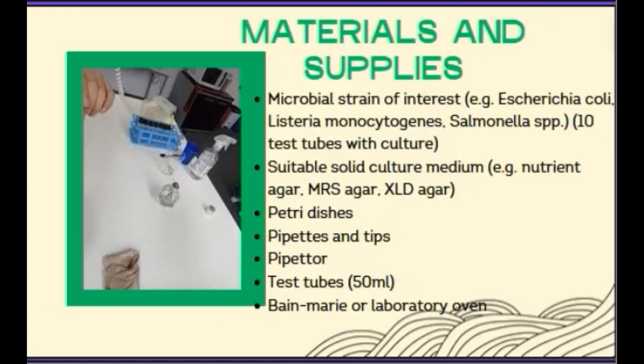Test tubes with culture, saline solution, culture medium, MRS agar, XLD agar, and Petri dishes. Pipettes and tips, 50 milliliter test tubes, and a water bath or laboratory oven.